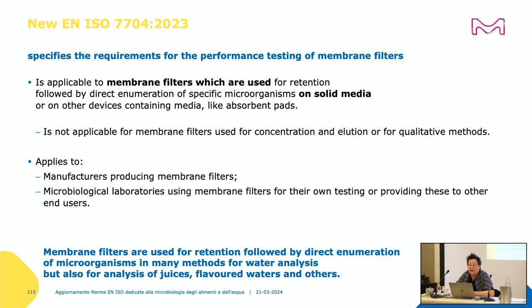This standard specifies the requirements for the performance testing of membrane filters, only those used for retention and then placed on solid media. Not for membrane filters used in enrichment for Campylobacter, for example, because that was too complicated. We first focused only on the membrane filters used for solid media. So it applies to the manufacturers of membrane filters, but also to the labs using these membrane filters for their own testing or providing these to other end users.